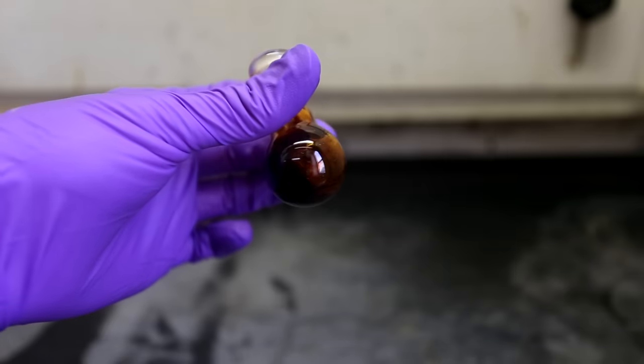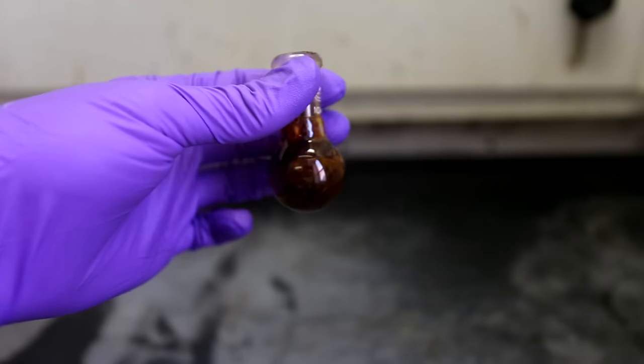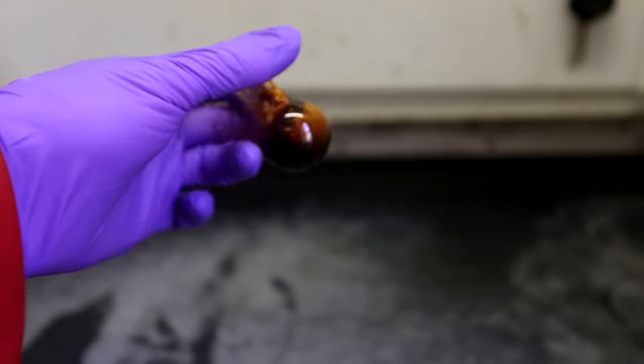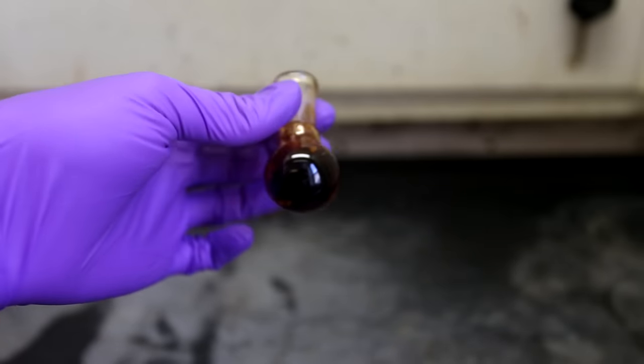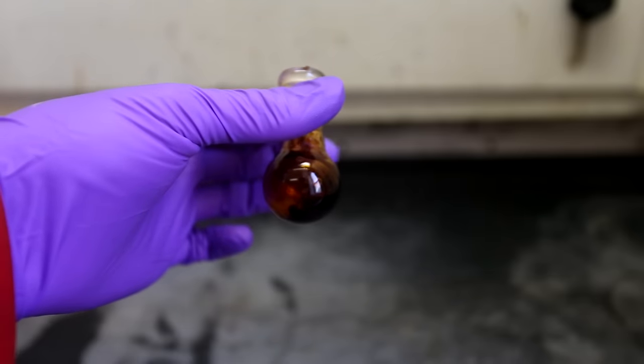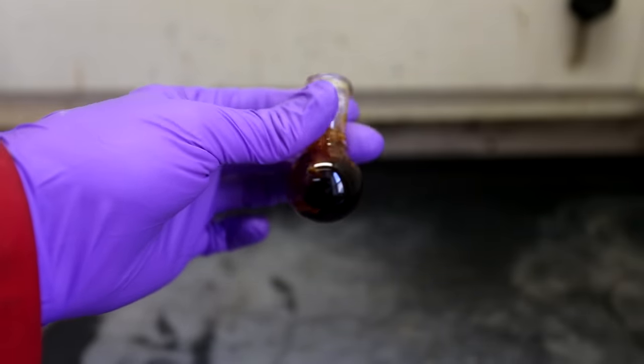I continued rotovaping the extract in a small 10 milliliter round bottom flask. I was left with a red viscous goop. The extract is red due to the presence of an abundant amount of beta carotene. This is an extremely strong capsaicin extract and should be handled with care.